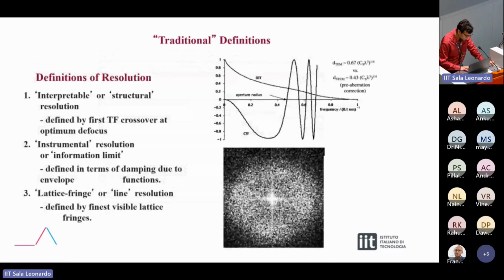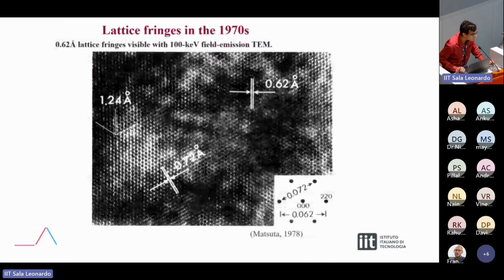So if you imagine from this point to this point here, but what happens, as I discussed earlier, is that you bring all the beams together to interfere, and when you interfere these two beams together, you get twice the resolution.